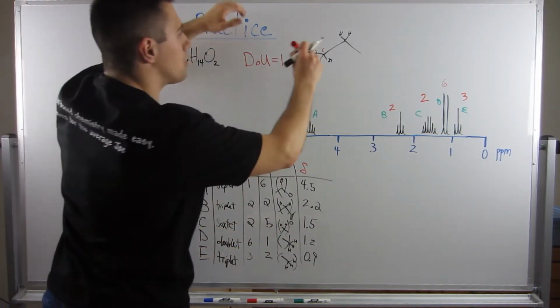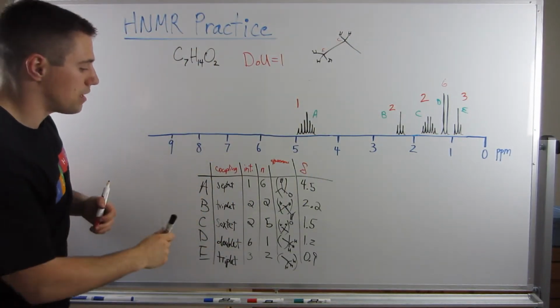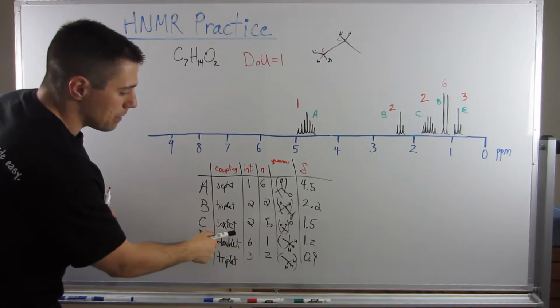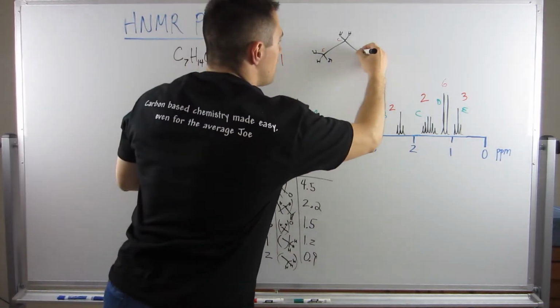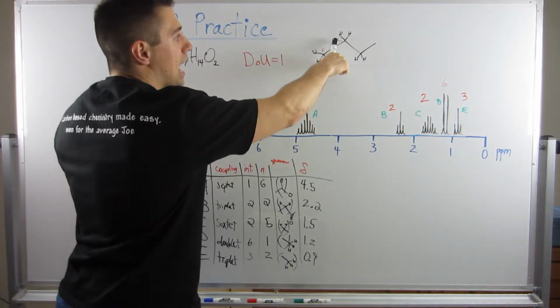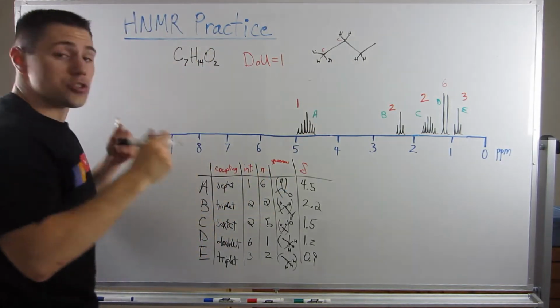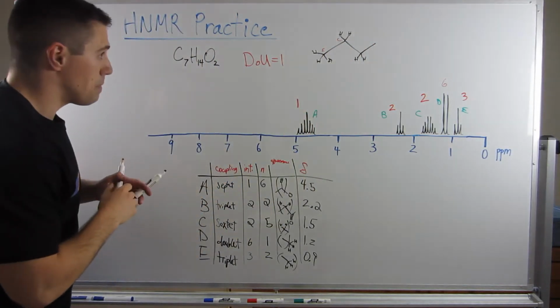So if I call this to be C, let's continue to draw the chain, see what we can make out from there. If this is going to be C, right, it needs to have 5 neighbors. Well, if those are 3 of my 5, and I continue the chain, I could have 2 hydrogens right there. C would then have 1, 2, 3, 4, 5 neighbors. So that works.